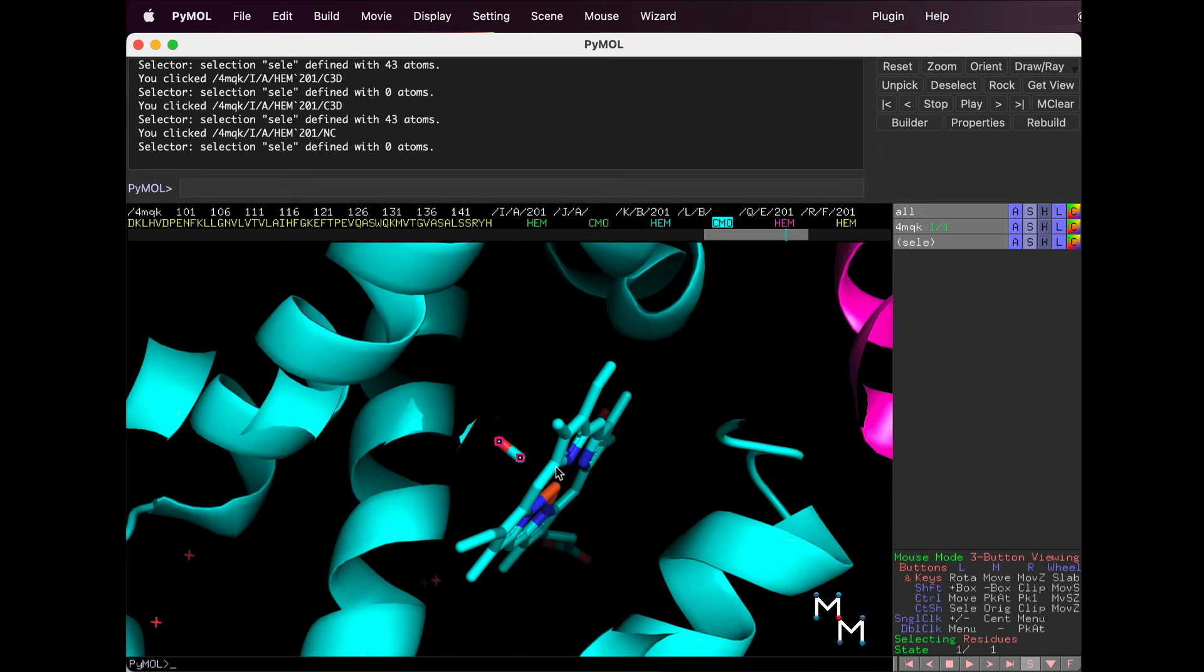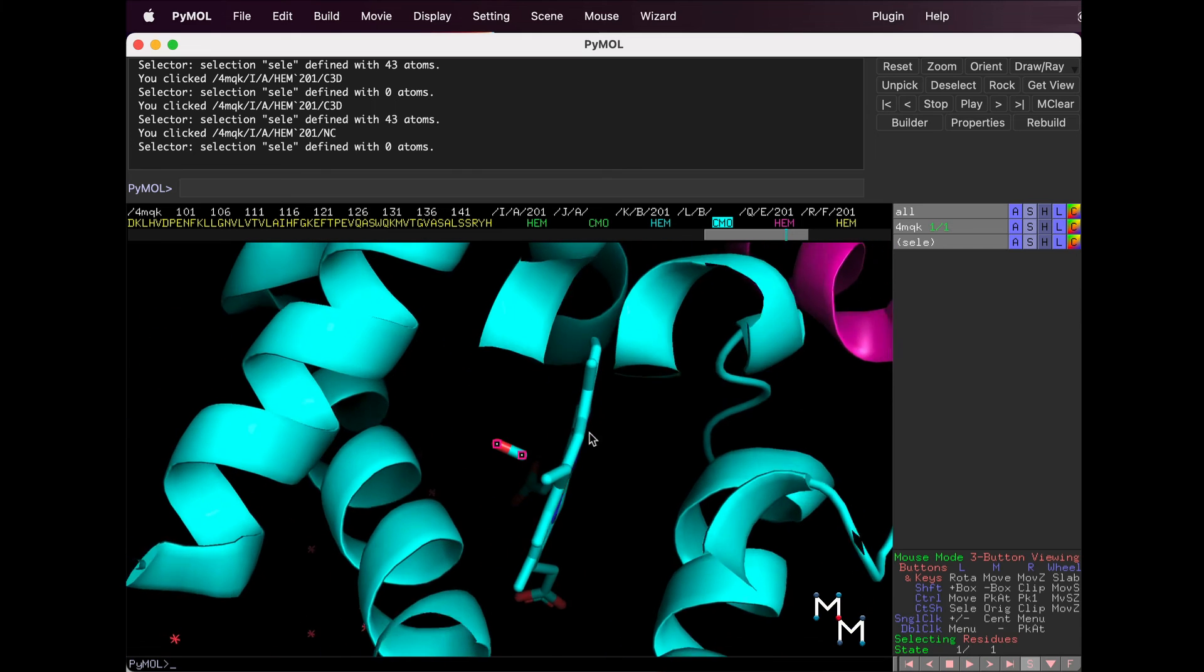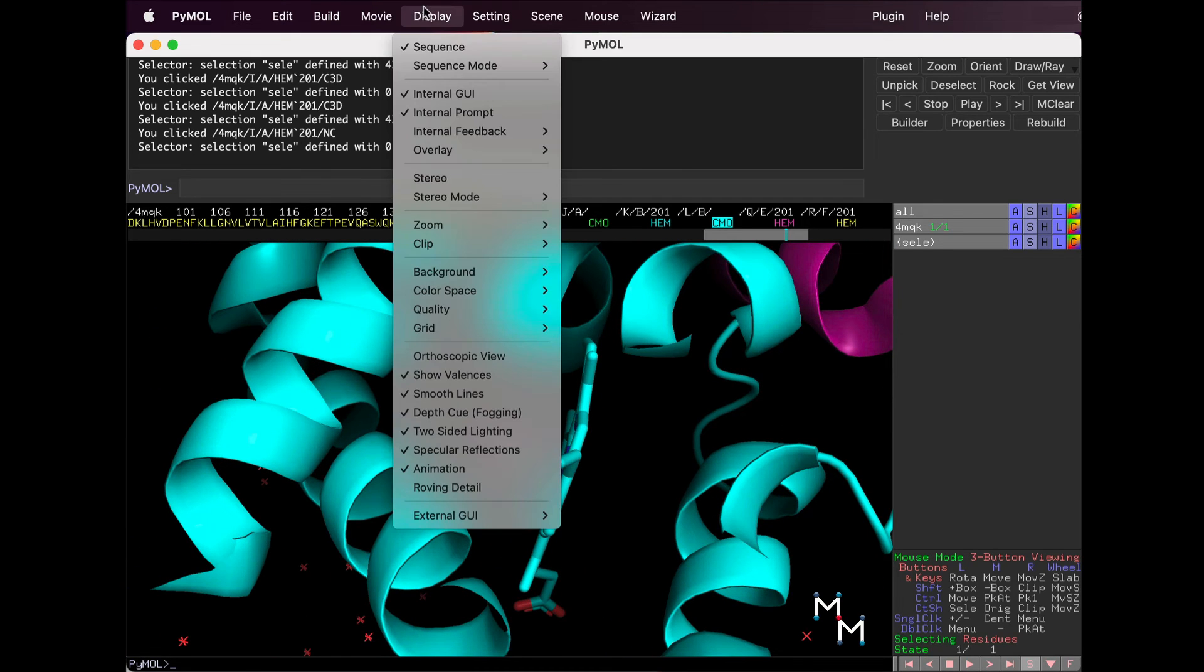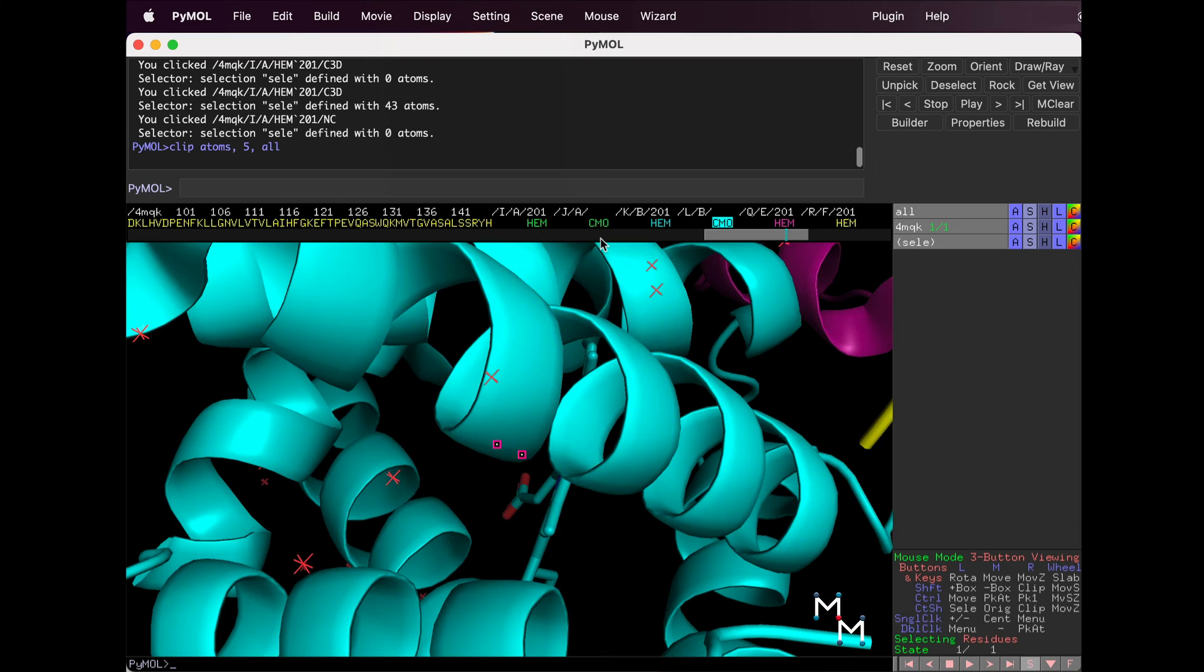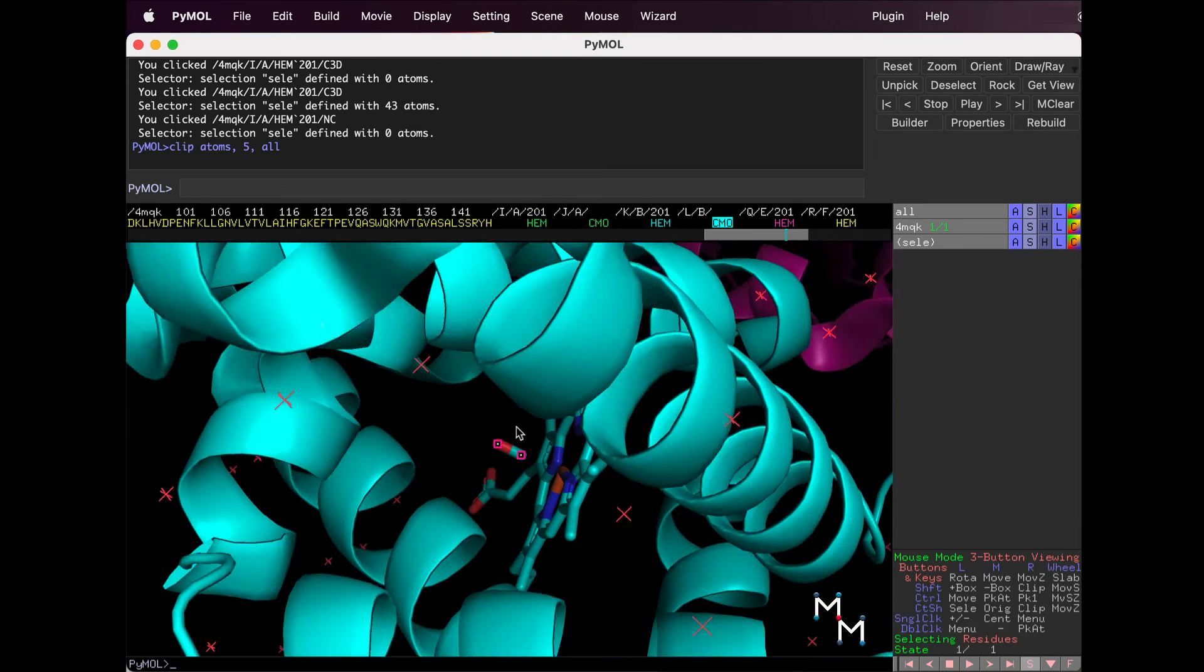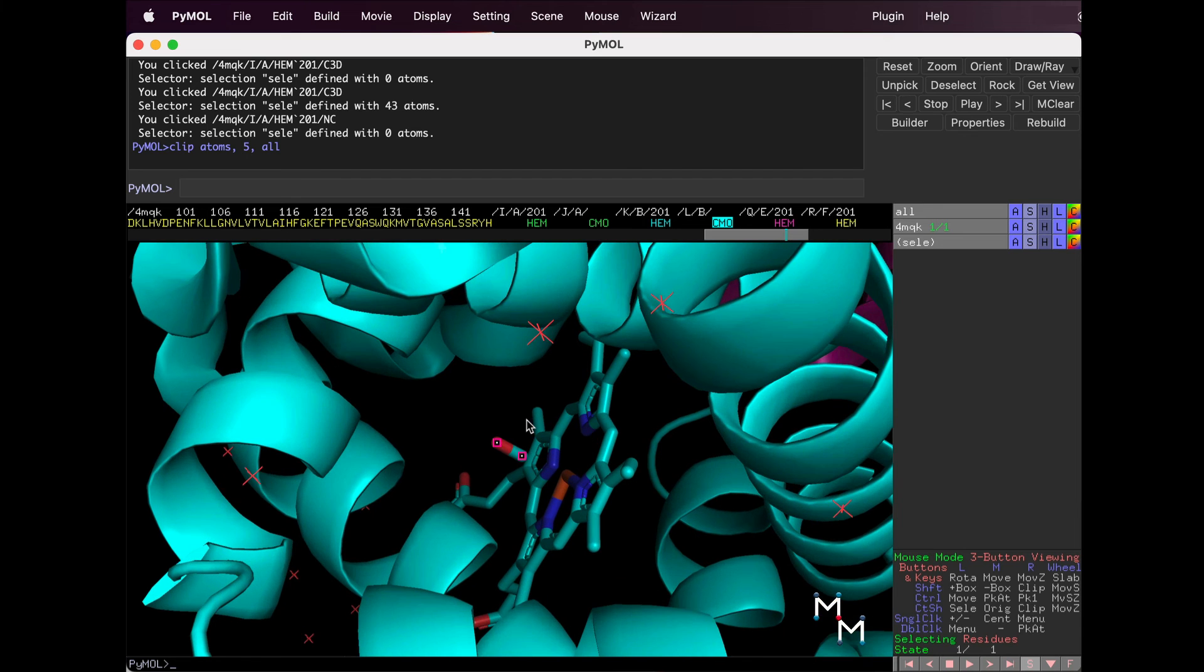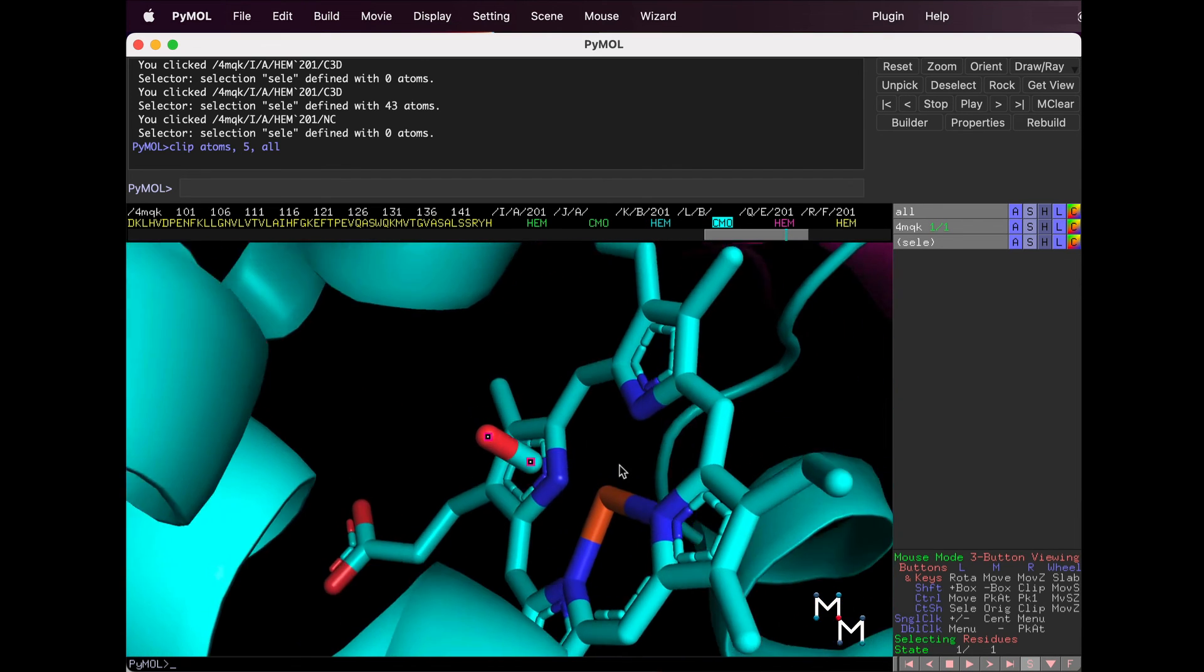Clipping can also be adjusted using the drop-down Display menu. Let's rotate the molecule a bit by clicking and dragging. We can see that the carbon monoxide binds near the heme in hemoglobin.